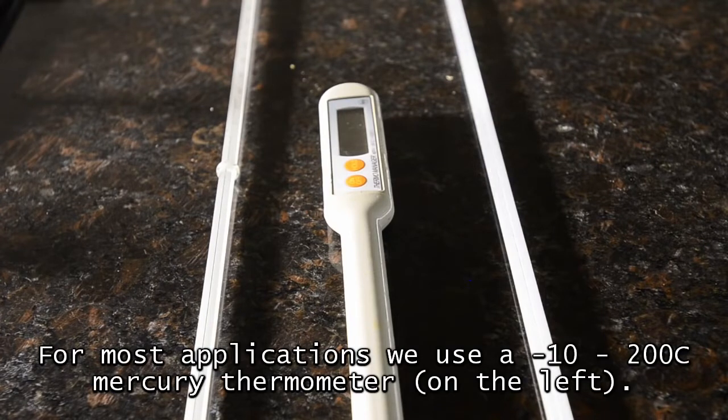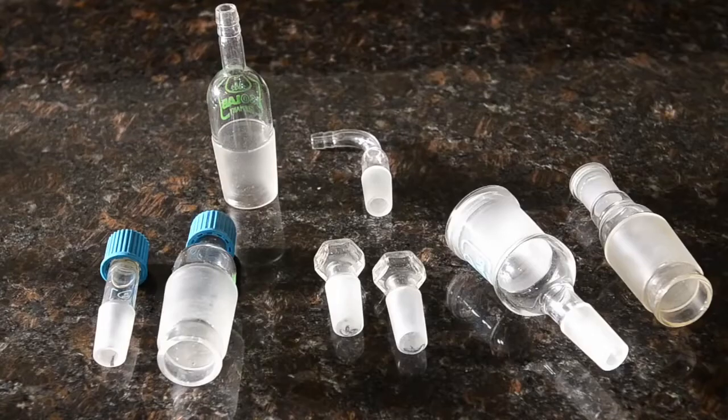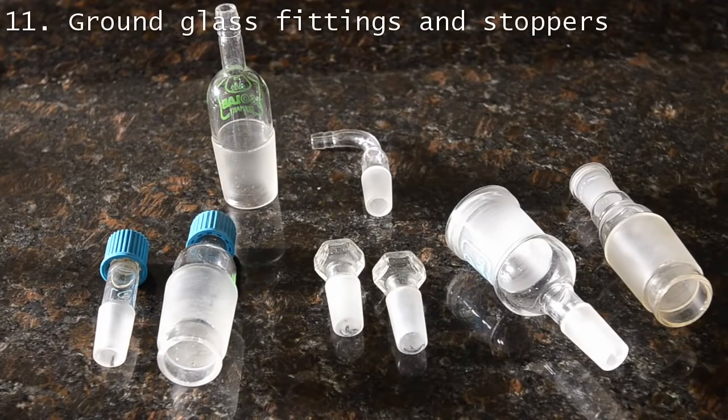One goes up to 200°C and the other to 400°C; we use the former most of the time. We also have an electronic thermometer, which is very useful and you'll see it a lot in our videos for oil and water baths. We have a few other useful ground glass adapters: gas takeoffs, stoppers, thermometer adapters, and also some conversion adapters in case we need to convert from one joint size to another.